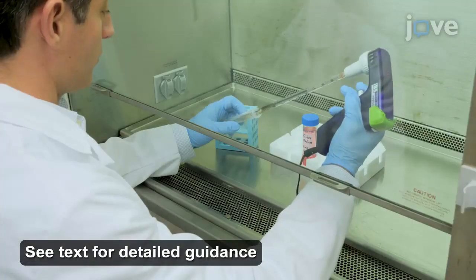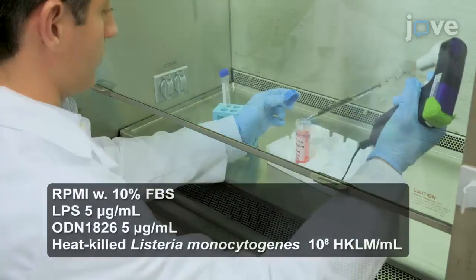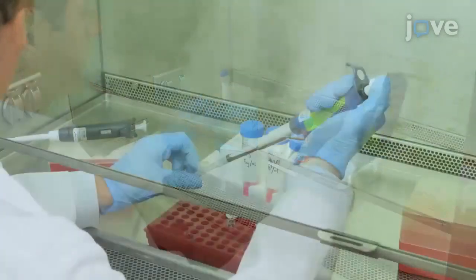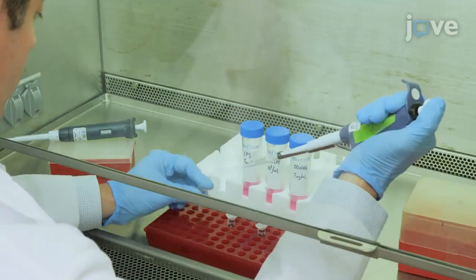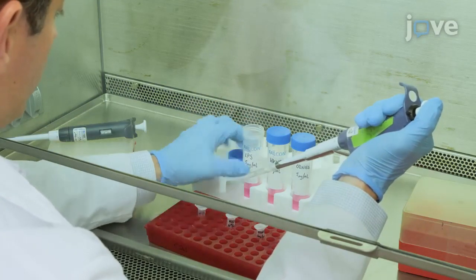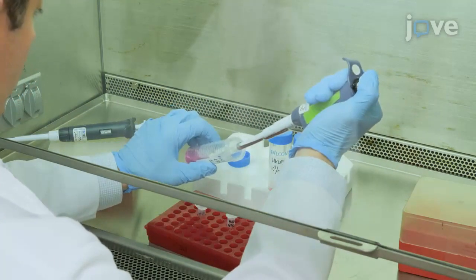To begin the protocol, prepare culture medium by adding fetal bovine serum to RPMI 1640 to a final concentration of 10%. Prepare 10 milliliters of challenge medium for each of the PAMPs to be tested in 50 milliliter tubes by adding the listed PAMP to the culture medium.